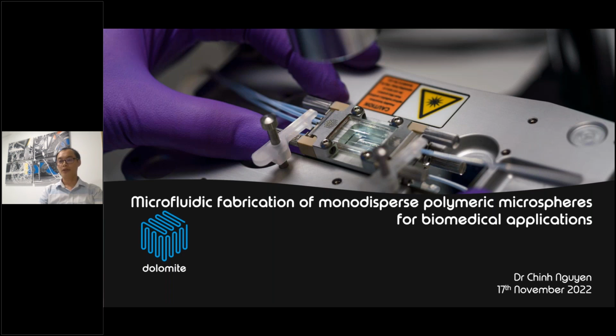So today we will talk about microfluidic fabrication of monodisperse polymeric microspheres for biomedical application.